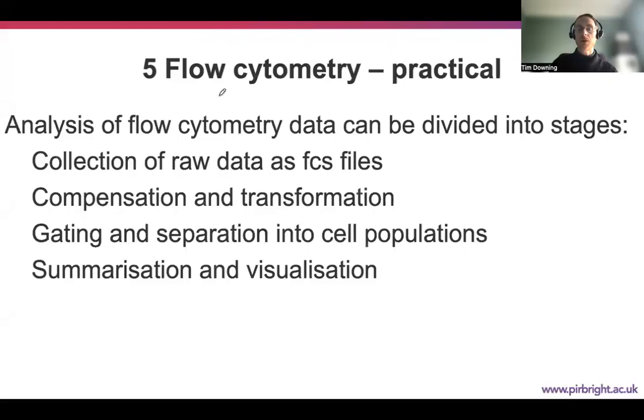So in this demonstration video, we're going to look at the F1 Flow Cytometry Analysis course and look particularly at this flow cytometry practical. What we're going to do in this practical is read in a set of FCS files as a flow set.